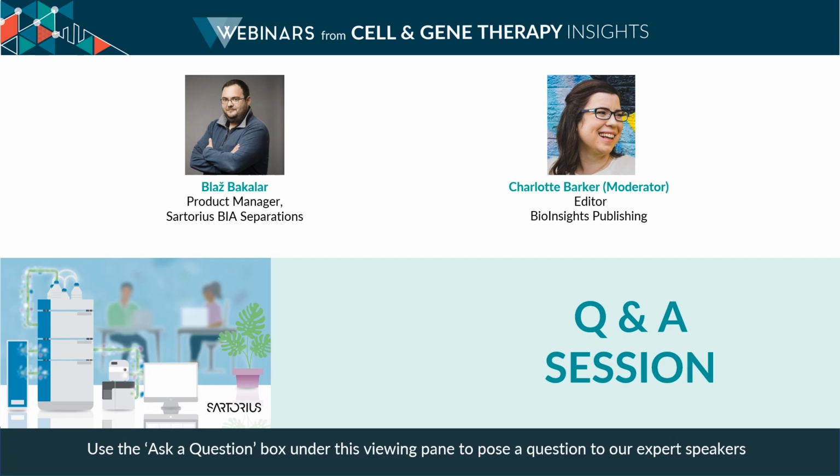And for mRNA analytics that I've been showing today, the primary workhorse, so the consumable, the column, was the CIMac PrimaS analytical column, around which we've developed a method and the platform as well.